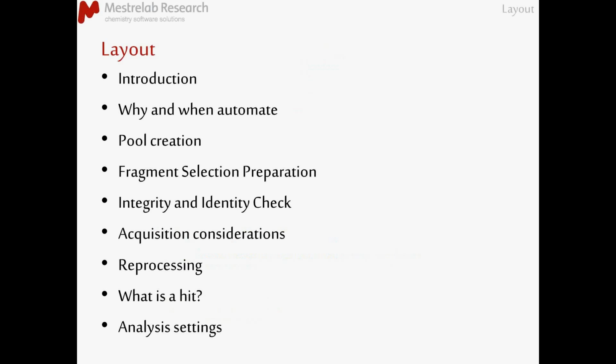What should we do in terms of reprocessing? When I was drafting the presentation, I was tempted to exclude the last bit because it may get a little bit philosophical, but I'm going to avoid any kind of non-practical discussion in that sense, and I'm going to be 100% pragmatic. And last but not least, we'll go into the full-on analysis and into seeing the software in action.